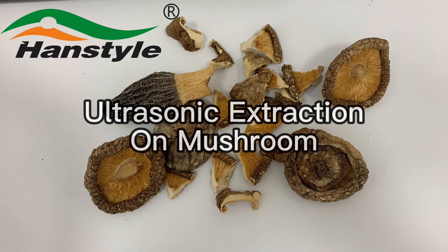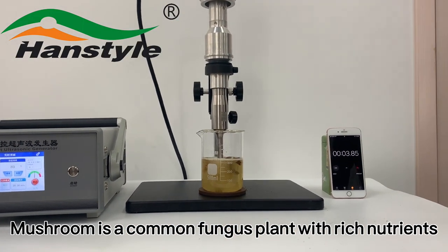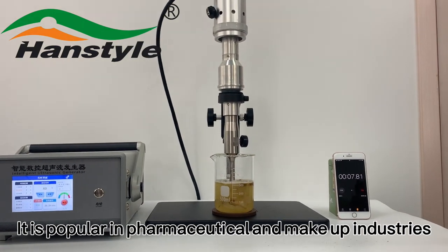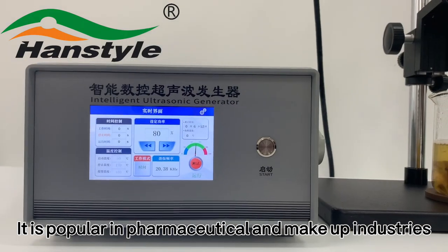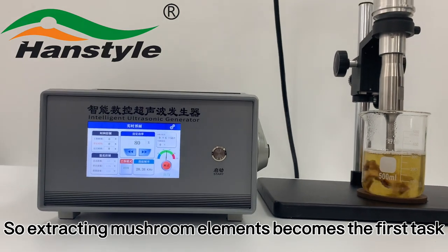Ultrasonic extraction on mushroom. Mushroom is a common fungus plant with rich nutrients, and it is popular in pharmaceutical and makeup industries, so extracting mushroom elements becomes the first task.